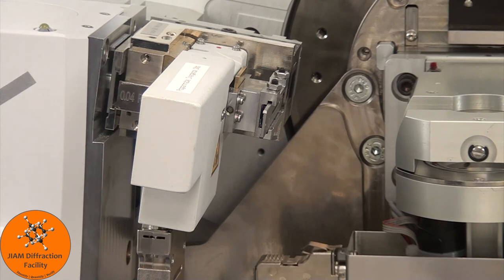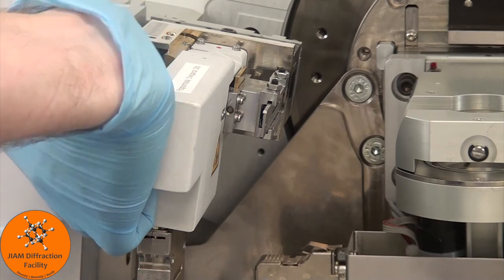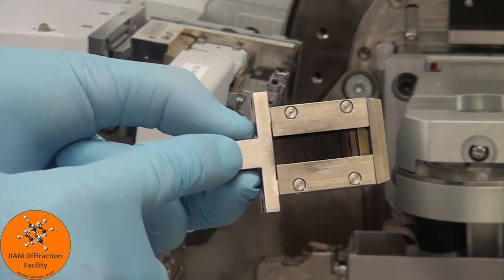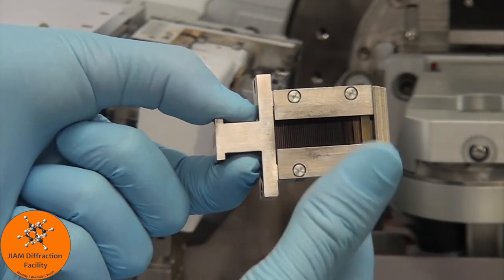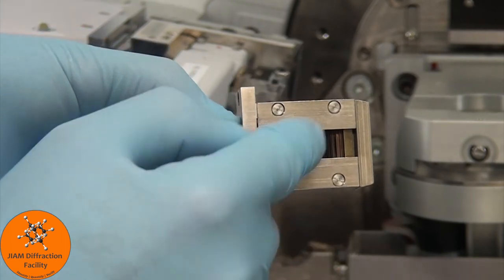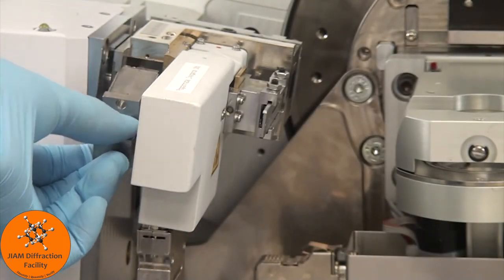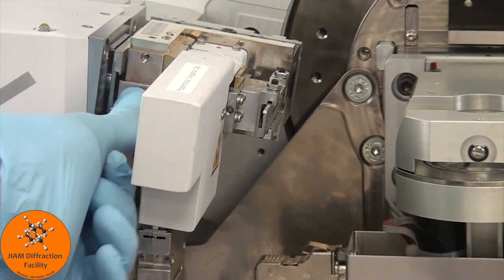If you need to change this optic, you can simply pull on it from there. I do ask that you handle it from this portion, not this portion, because you don't want to accidentally touch those plates. And then to insert the correct one, just press until it stops moving.